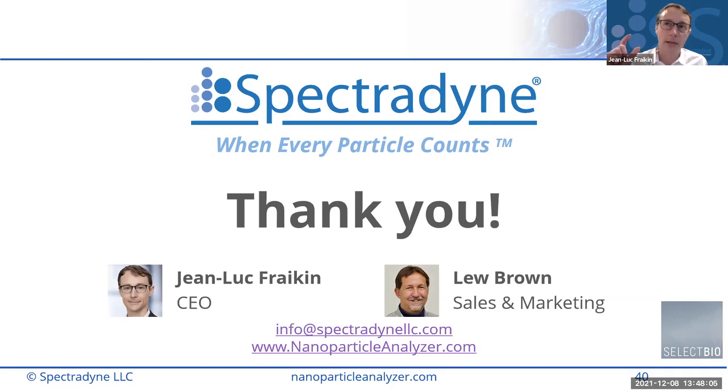I'll jump ahead to the third question, which is about different measurement ranges. In order to span that whole range from 50 nanometers up to 10 microns requires 3 separate cartridge measurements. So we have pores with different sizes, right? Different constrictions with different sizes. Particles that are smaller than the detection limit for a given size just are not measured. They don't generate a measurable signal in the system.